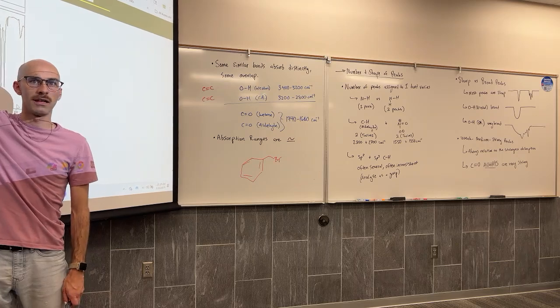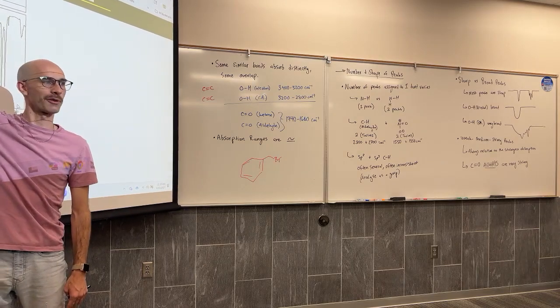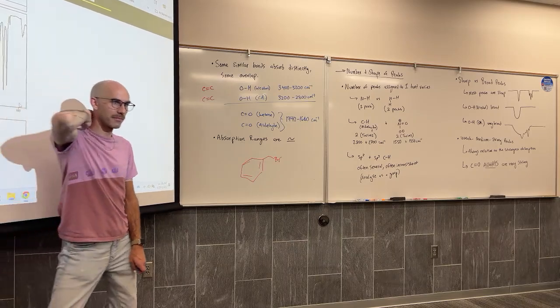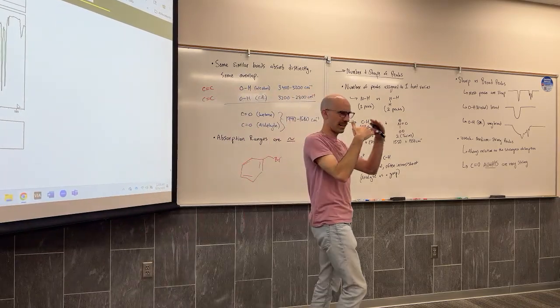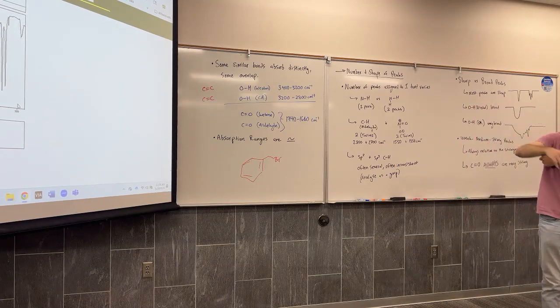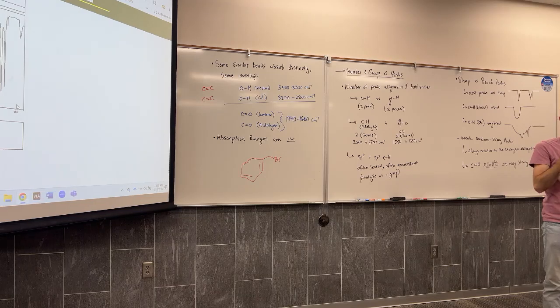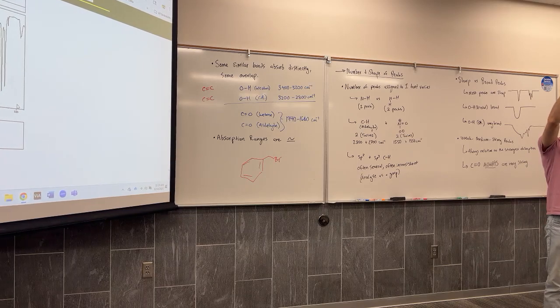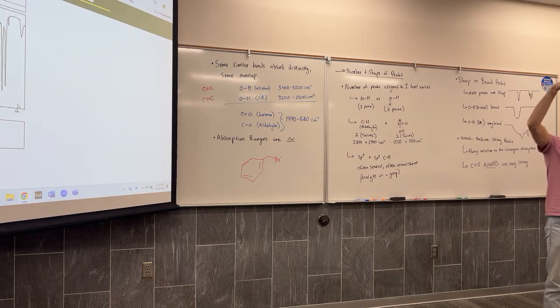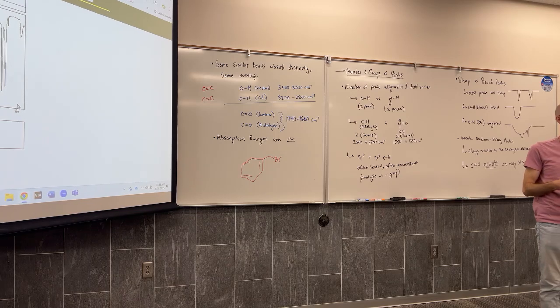Now, actually, one of the issues here is that the instruments that take this spectrum are kind of manipulating the data so that it's all relative to itself. I know that it says percent transmittance, but it's similar to mass spec where you've got relative intensity, which is just normalized to the tallest peak. It's something similar here. It's not necessarily always the same intensity. It's made relative to the sample.